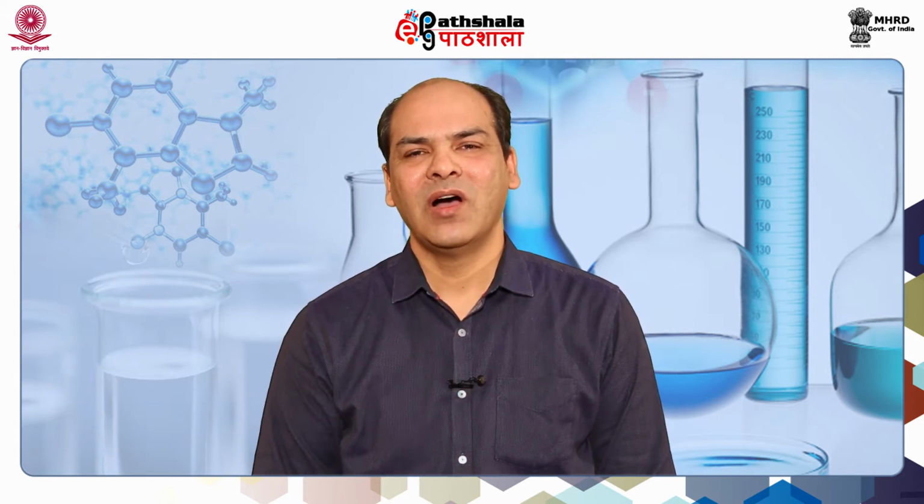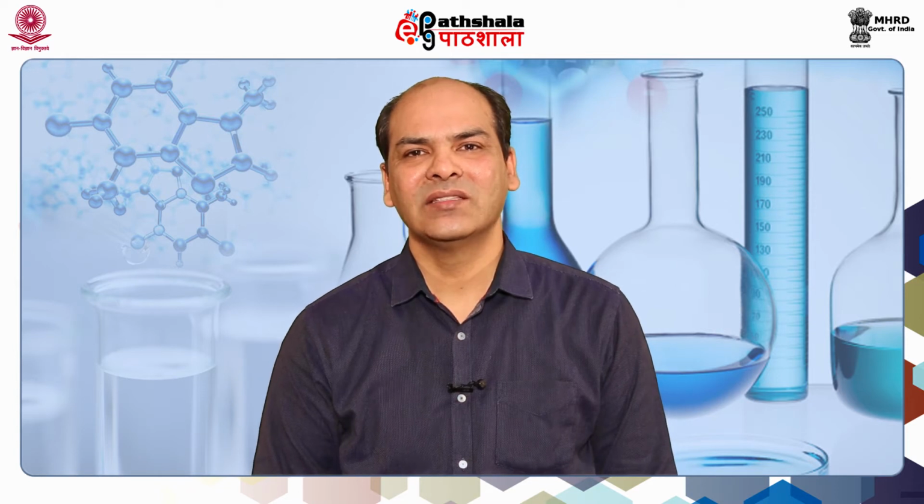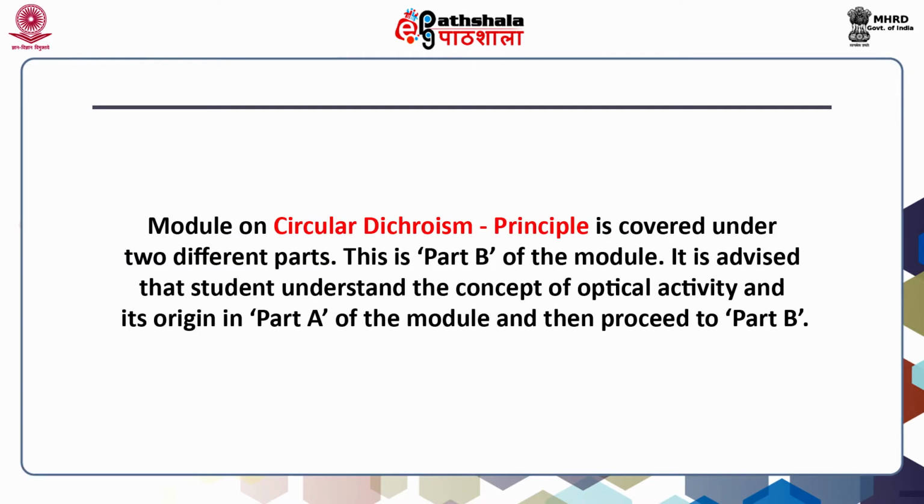Today I will be talking about two related techniques, circular dichroism and optical rotatory dispersion. The module on circular dichroism principle is covered under two different parts. This is part B of the module. It is advised that students understand the concept of optical activity and its origin in part A of the module and then proceed to part B.